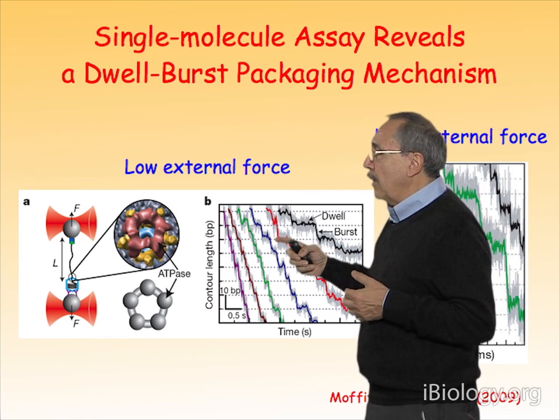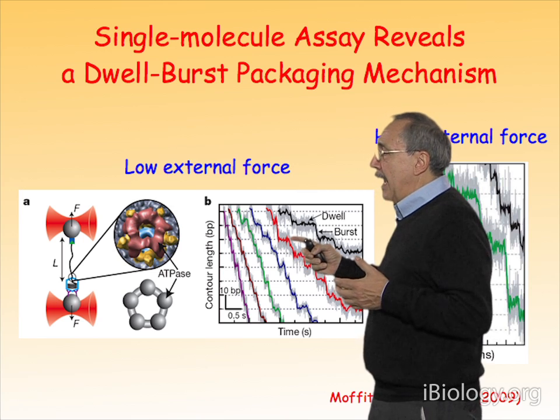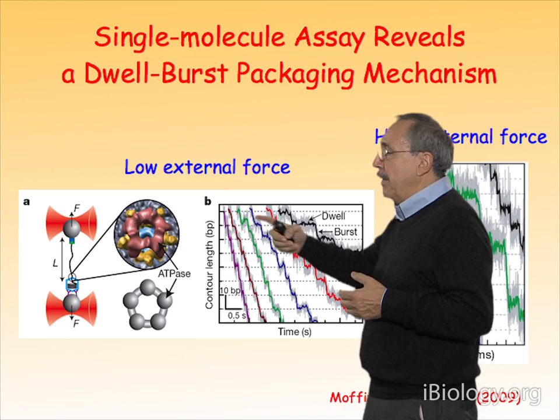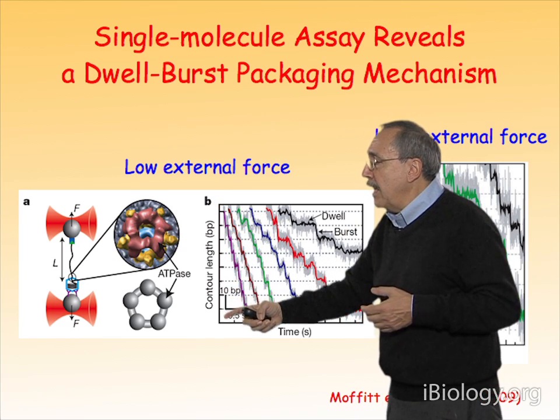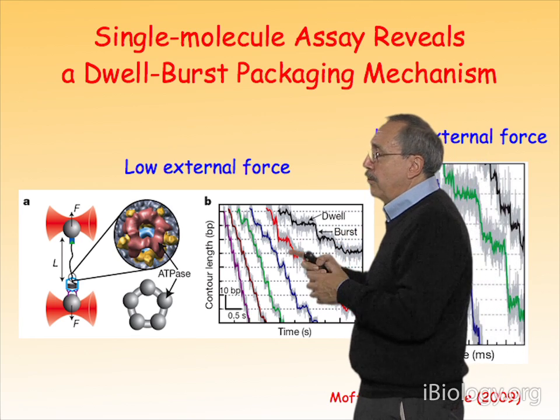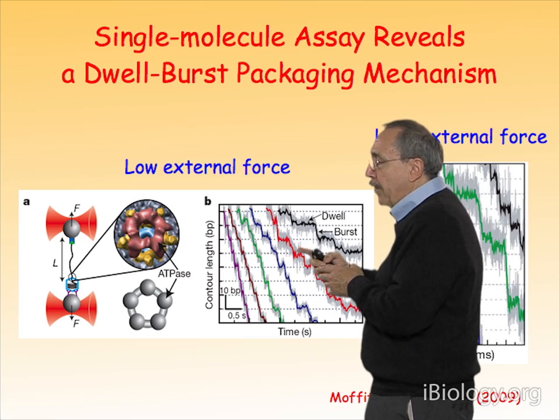It turns out that these dwells are the times when the motor is binding ATP, and the burst, of course, is the time when the motor is packaging the DNA, because we are plotting here on the y-axis the length of the DNA as a function of time, just as before. It's just that now we have enough resolution that we can actually see the individual steps of the motor.